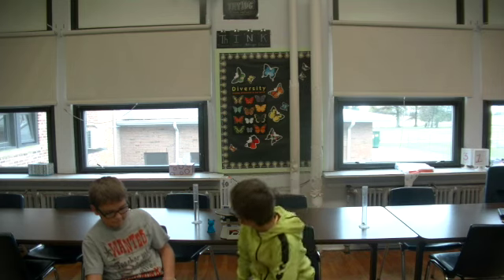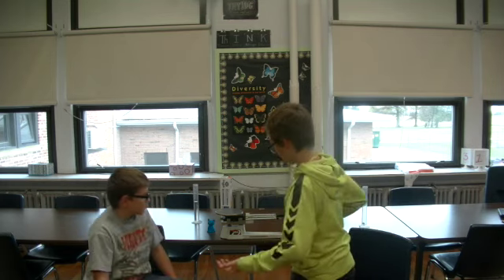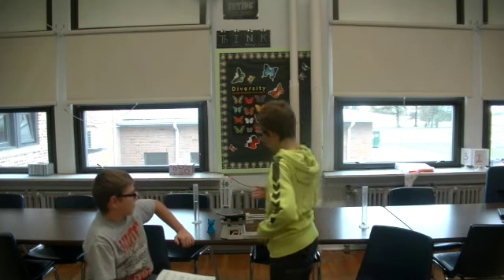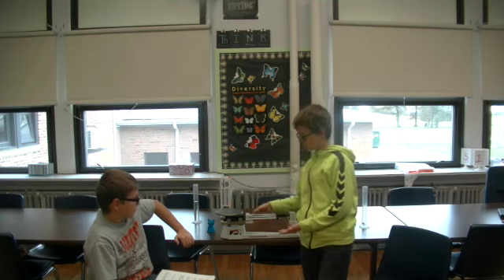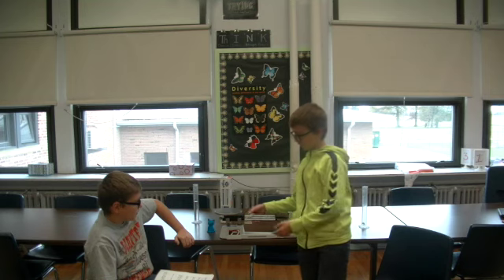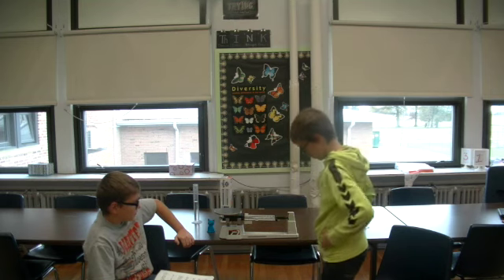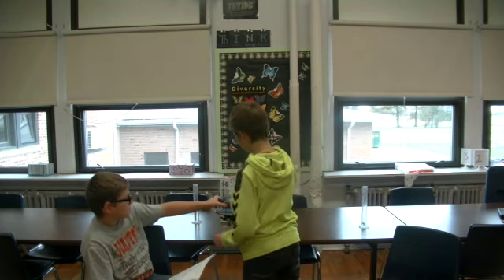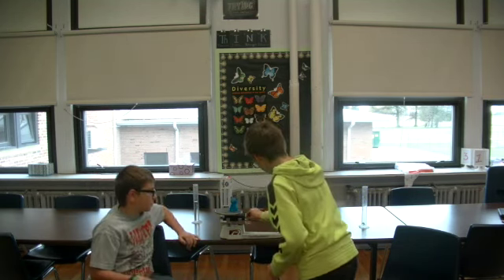So what's volume? Volume is the space something takes up. Okay, so going back to the mass question, how do you find evidence for mass? Well, as you can see here, I brought a triple beam balance. Want to know what it is? Sure. Okay, well, the triple beam balance is a balance beam that has 3 riders. One for the hundreds, one for the tens, and one for the ones. Want to place something? Sure. Okay, let's try it.